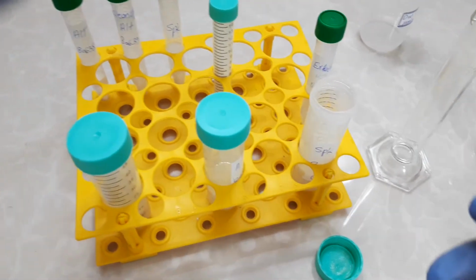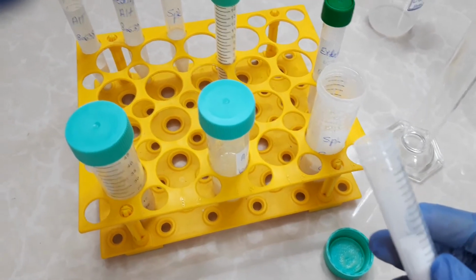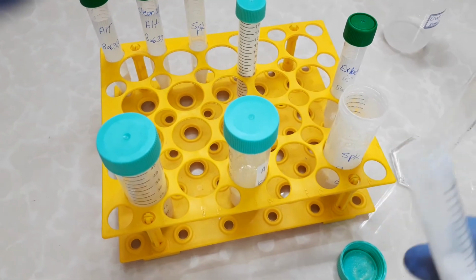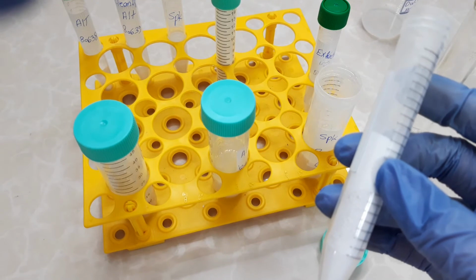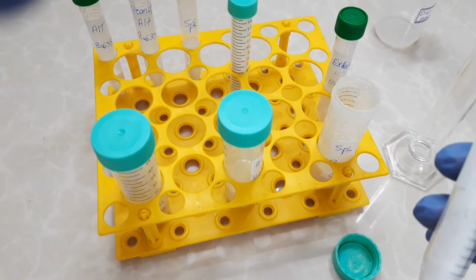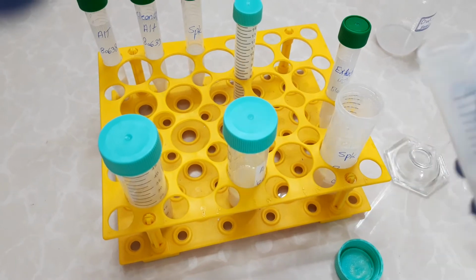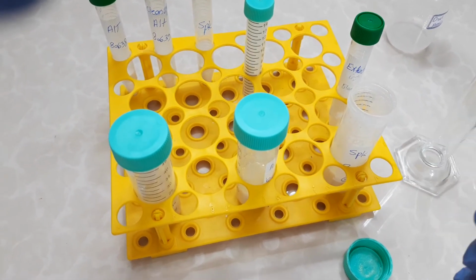In this step, we add the extraction kit to the sample in order to salt out the water that is in the sample. It's good to mention that this extraction kit involves trisodium citrate, disodium citrate, and also magnesium sulfate anhydrous. Then after adding it to the sample, shake it as quickly as possible.